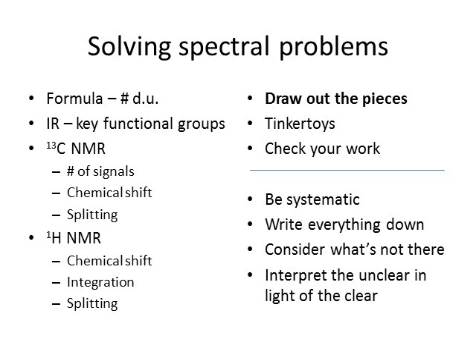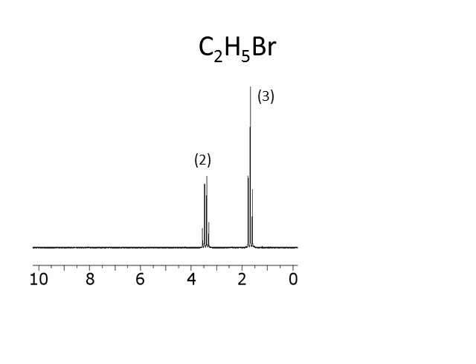If I've got multiple spectra, I almost always have more information than I need to figure out the structure. And so I don't necessarily have to interpret every little squiggle in the spectrum. As long as I come up with an answer and then I go back and look, it should be consistent with all of those squiggles. But I don't have to start out by, for instance, trying to look at the fingerprint region of the IR and see what that tells me. I wouldn't bother, for instance.